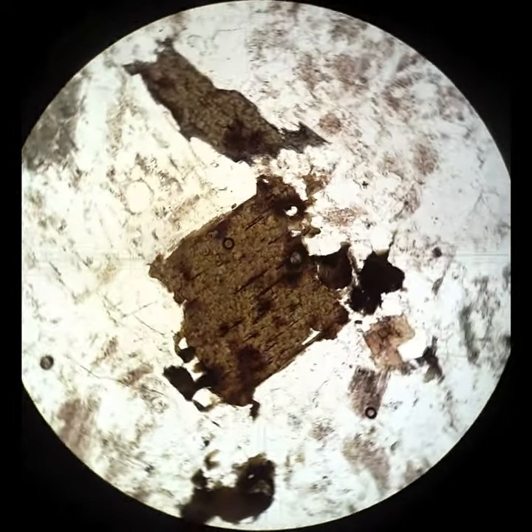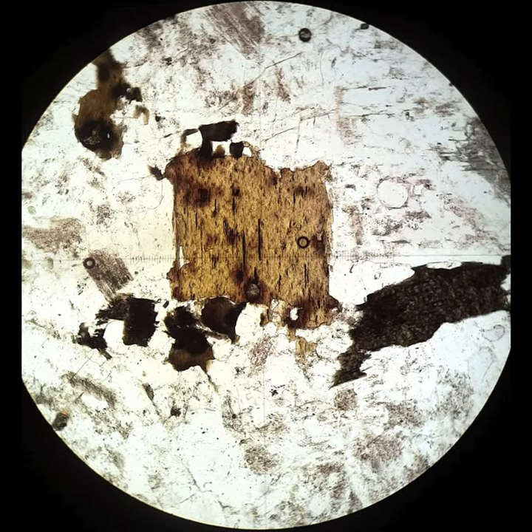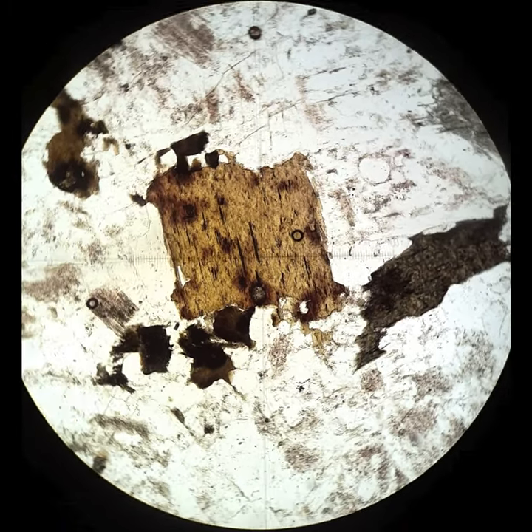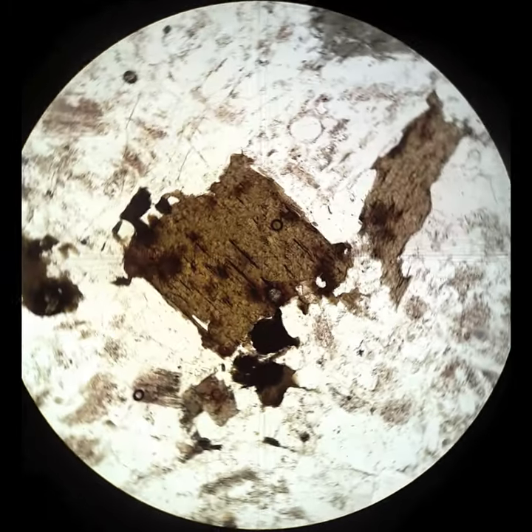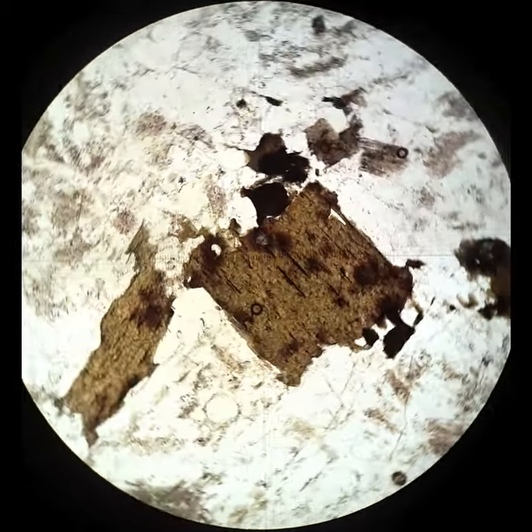Pleochroism can be really intense. This is biotite — light when the cleavage planes are running north-south, almost black when they're running east-west. This is called normal pleochroism, when the orientation of the cleavage planes is parallel to the lower polarization.